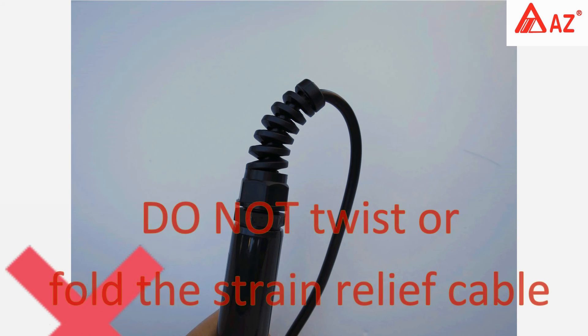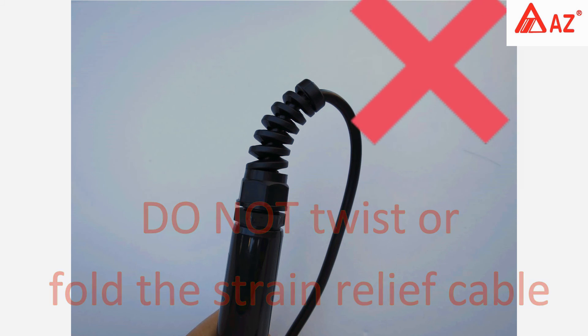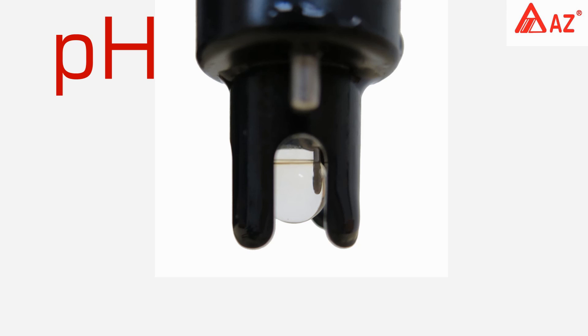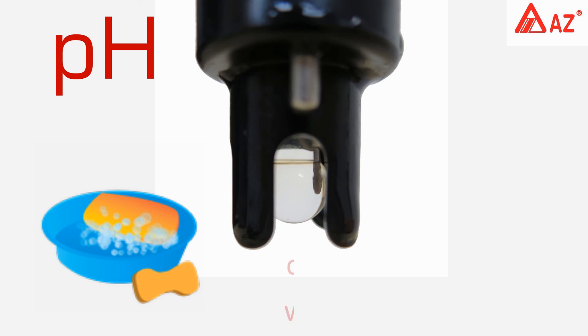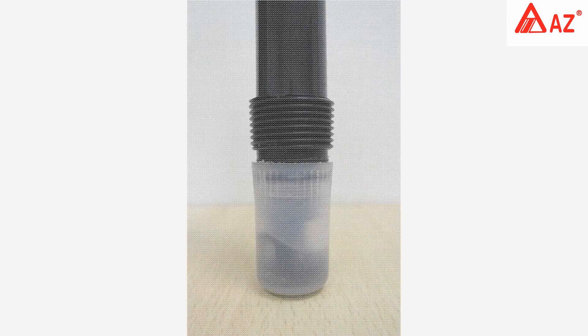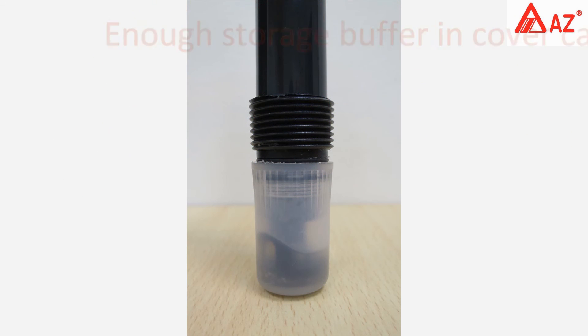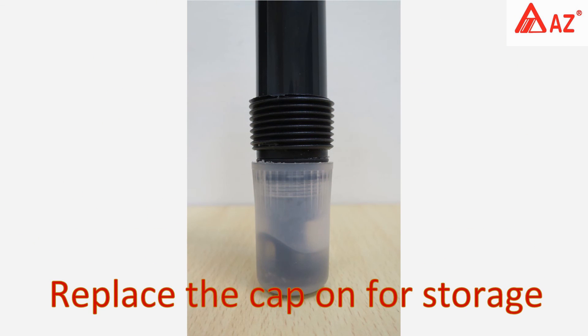Do not twist or fold the strain relief cable. If the pH probe is stained with grease or dirt, clean it with neutral detergent. Make sure the pH glass bulb is moistened at all times and there is enough storage buffer in the cover cap. Replace the electrode cap for storage.